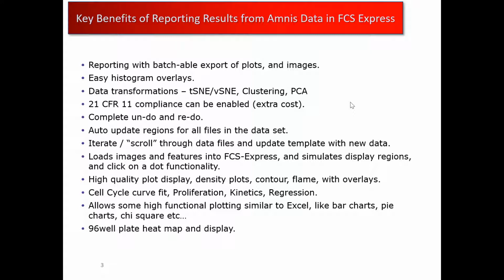I know one of the things that's difficult to do in Ideas software is create histogram overlays. Of course, FCS Express makes it very simple to do with a drag and drop. The software can also be used to perform data transformations. tSNE, viSNE, SPADE, clustering can all be done with your Amnis image cytometry data. If you work in a regulatory environment and you need 21 CFR Part 11 compliance for your analysis software, FCS Express has some functionality and features that can help you meet that compliance in certain versions of our software.